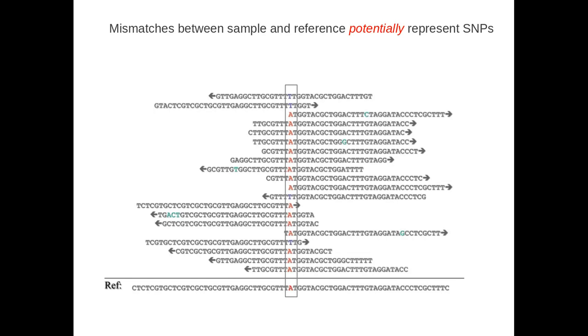And one of the things about these mathematical models that take the error probabilities from read data and assign genotypes, and can then assign a probability of that genotype being real or false, is that those genotyping models all assume that the read mapping, that is the alignment step, is perfectly correct. Okay, so there is no error in the mapping.